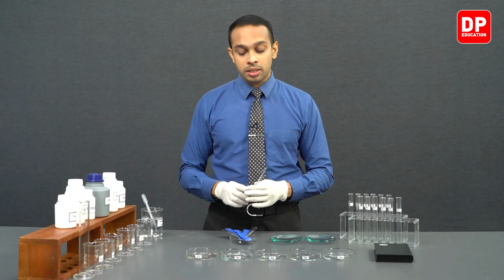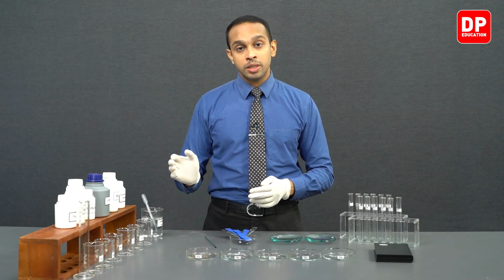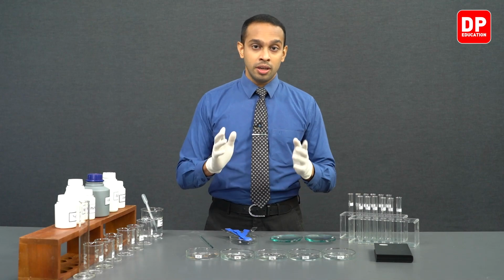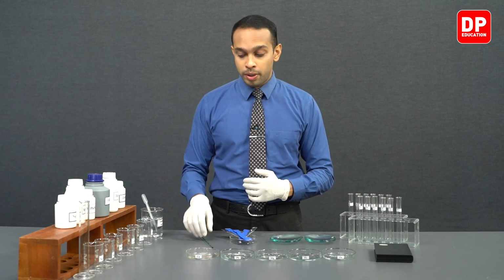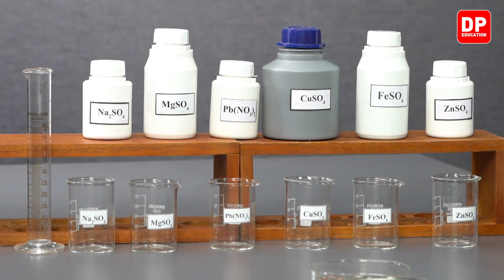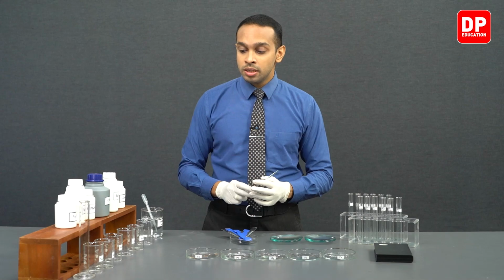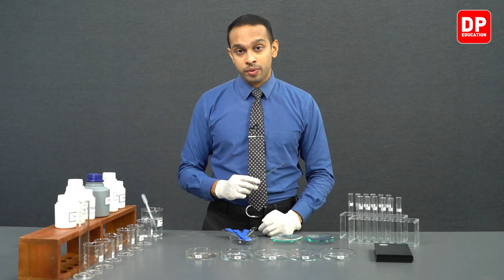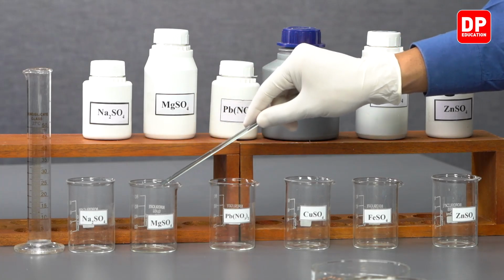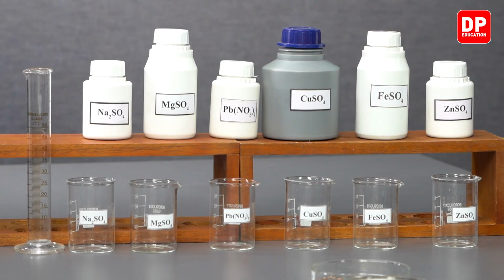And we'll be using these solids and dissolving them in water to prepare 1 mole per decimeter cube concentrated aqueous solutions. In order to prepare those solutions, we'll be using a measuring cylinder to measure 50 milliliters of distilled water, and we'll be measuring the relevant masses we need, and preparing 1 mole per decimeter cube concentrated solutions in each of these beakers. And even the beakers are labeled so that we can identify which solutions are in which beaker.